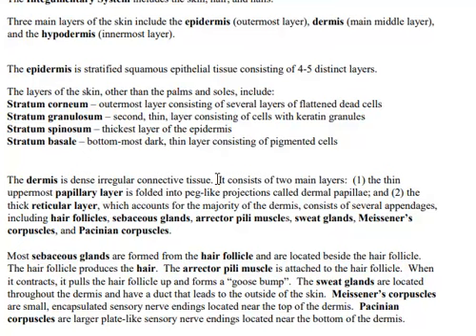The erector pili muscle is my second favorite muscle in the whole body, and it is attached to the outer covering of the hair follicle.